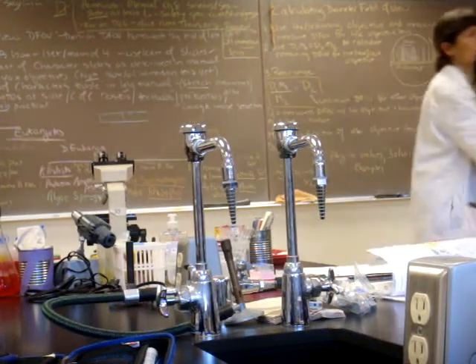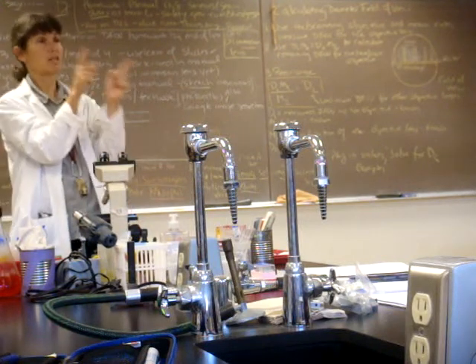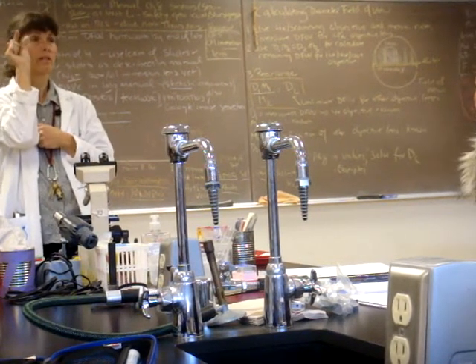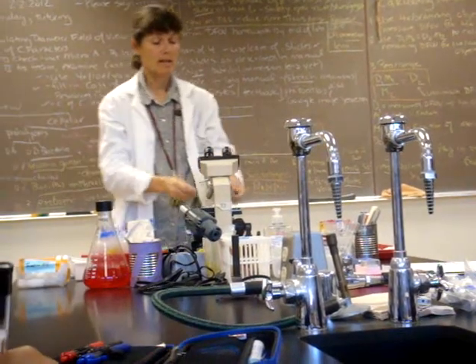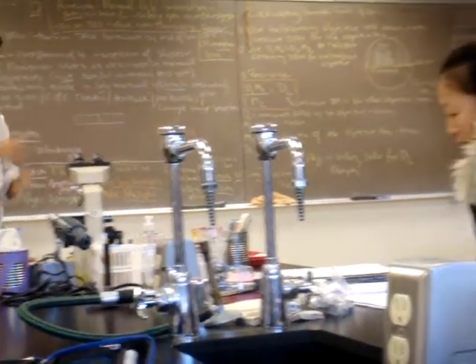So, what does that matter? Well, the reason we can't use a ruler to directly measure the diameter of the field of view, say for the 40X lens and the oil immersion lens, is that the diameter of the field of view is less than 1 millimeter. There's no way for us to measure it using our metric rulers, right? That's why we have to use these mathematical equations to get there. Okay, so let's do an example.